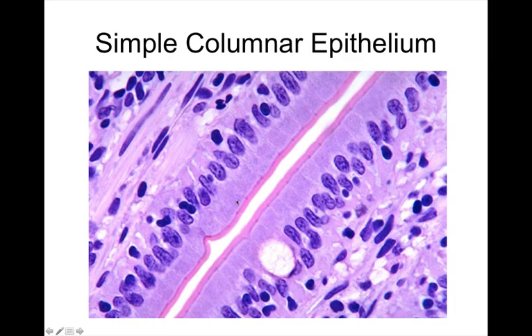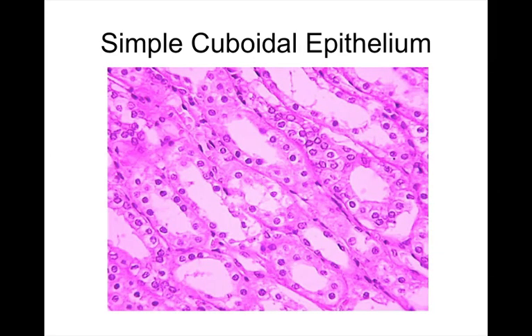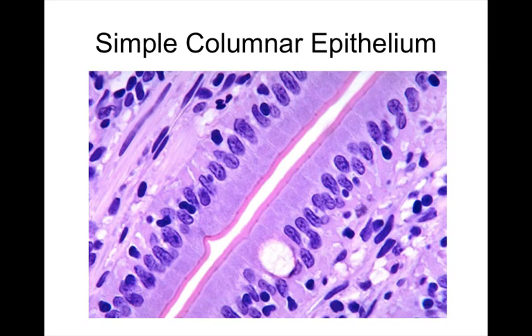We're looking here at almost a little crack within some villi in the gut. And this looks pretty nice, showing the microvilli, like this haze of microvilli, not a sharp apical surface like we saw in the preceding slide. Here, those would be flat surface cells, whereas the apical surface here has those microvilli.